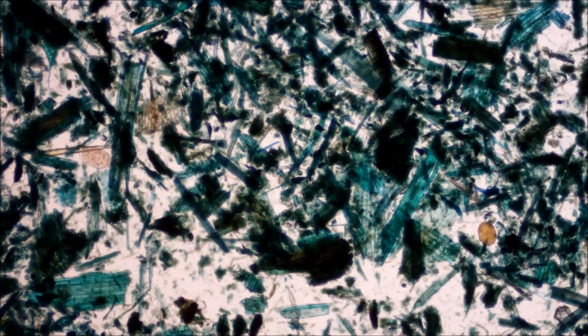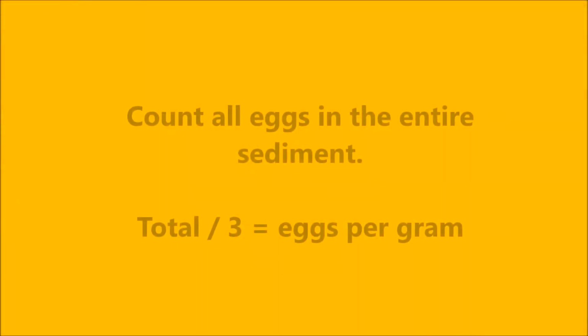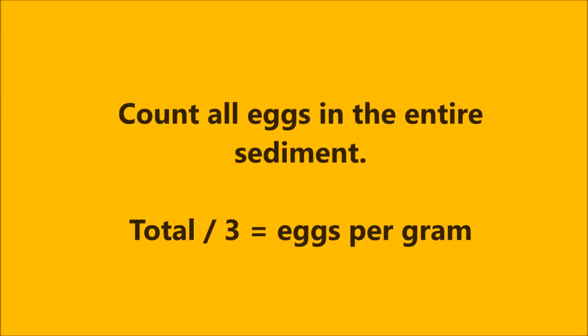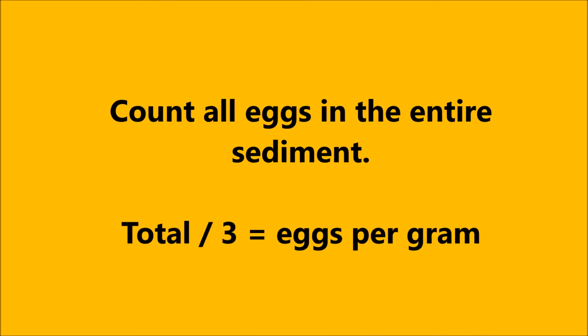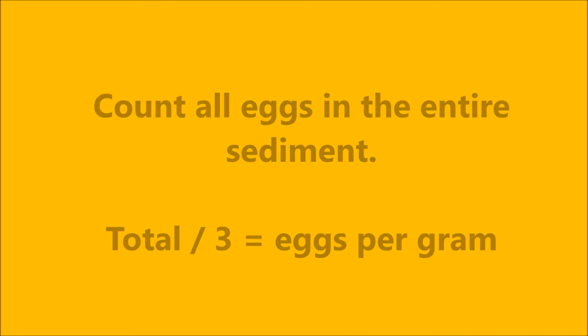Scan your whole slide and all of your sediment. Once you've counted all of the eggs, divide your total by 3. This equals eggs per gram.